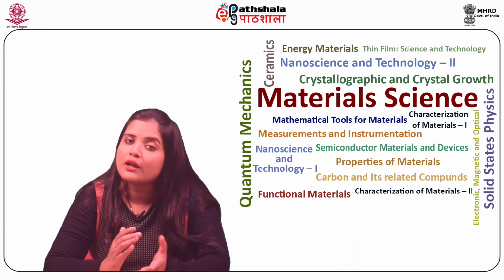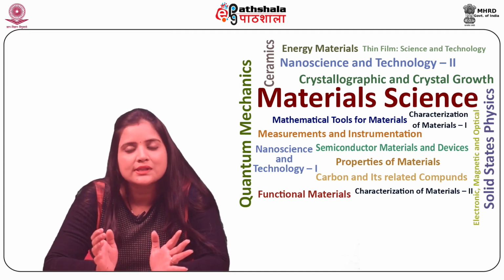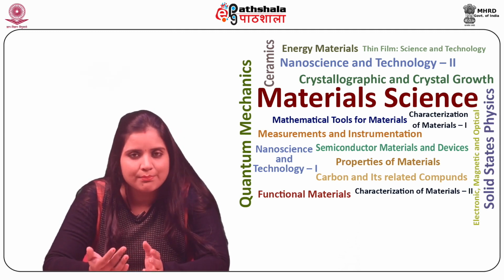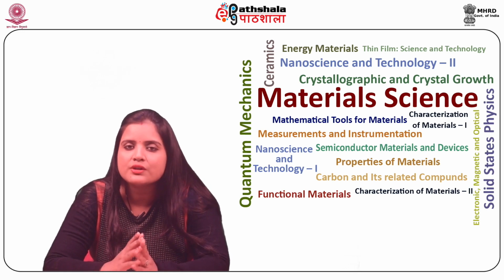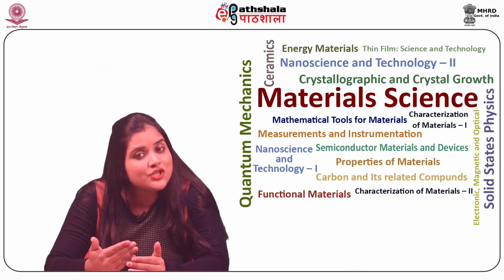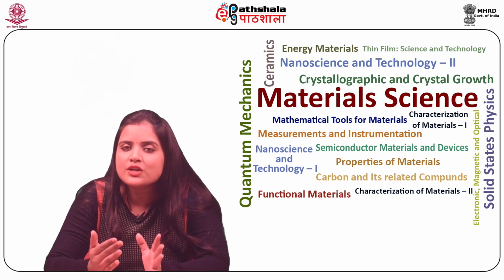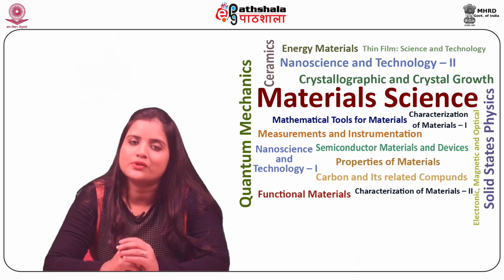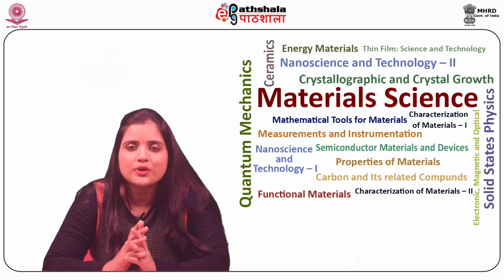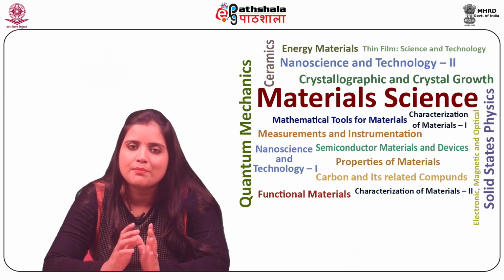It uses a cantilever having a sharp tip, that is the probe, which scans the specimen surface. To image the sample, the tip is raster scanned over the surface of the sample. As the tip moves, the forces between the tip and sample deflect the cantilever as per Hooke's law. Additionally, these forces can also be used to change the sample's properties in a controlled manner.